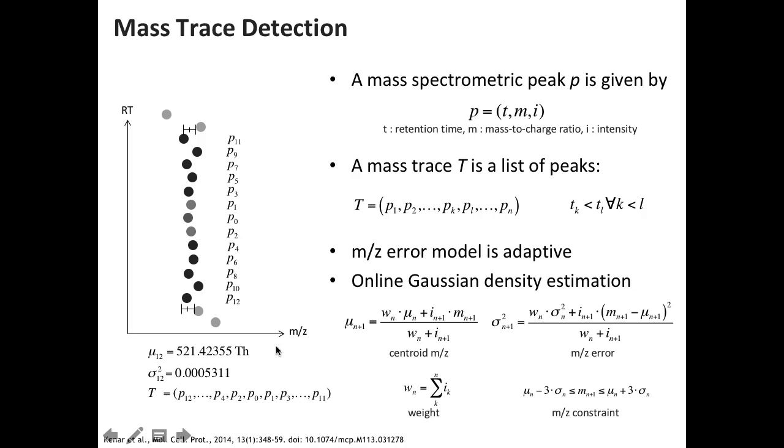So would you not account for how instruments have a higher error bias in the lower mass ranges? That is where we abort it, because that is how we detect that we shouldn't be looking there anymore. So we're not going all the way into the noise. We're going into the noise, but not further. Oh, you're talking about ppm error. No.